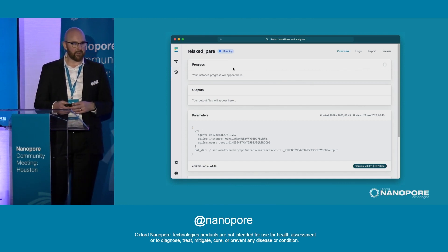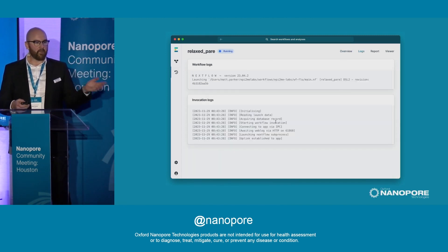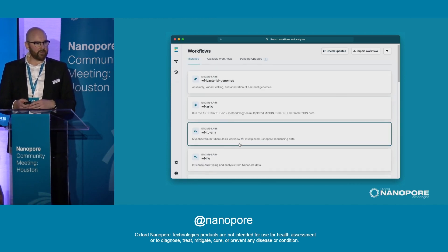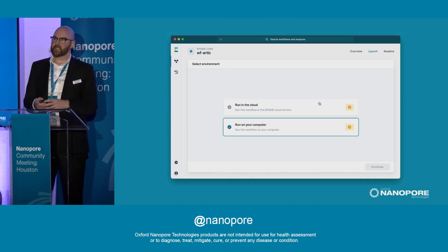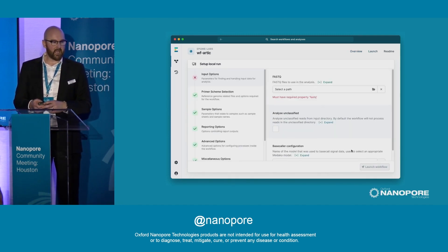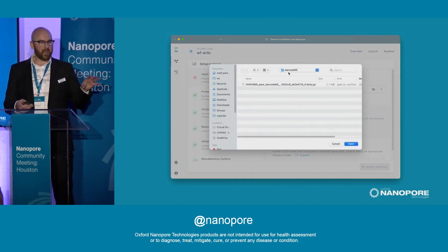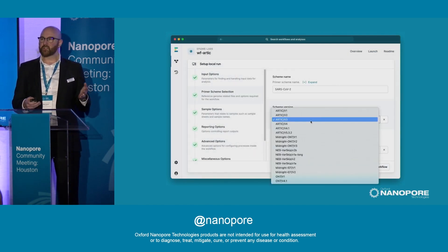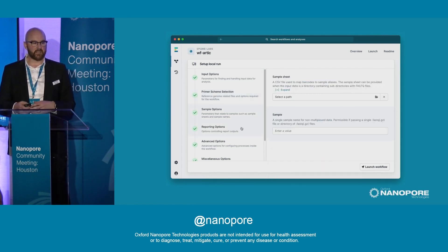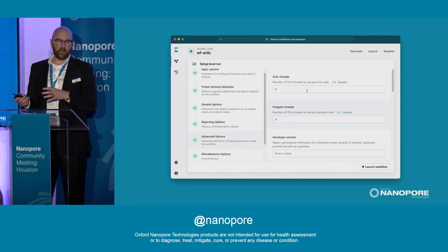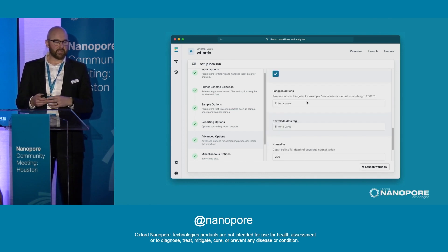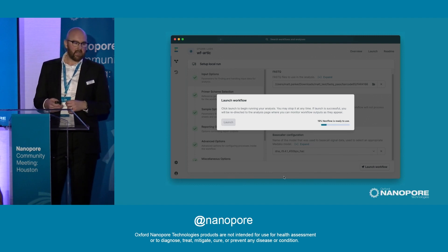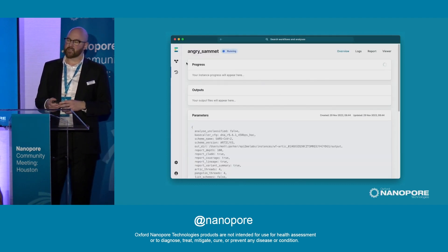I've actually launched this one in the cloud, so you get an overview of the running and you also get the logs. I'm going to look at some other workflows now — specifically workflow Arctic for SARS-CoV-2 and lineage identification — and I'm going to run this locally on my computer. I'm selecting some FASTQ files, opening them, and there are other options you can provide if you'd like to customize your analysis. We set sensible defaults, but we allow power users to customize the analysis to their needs. Click launch and it will take you through a SARS-CoV-2 analysis.